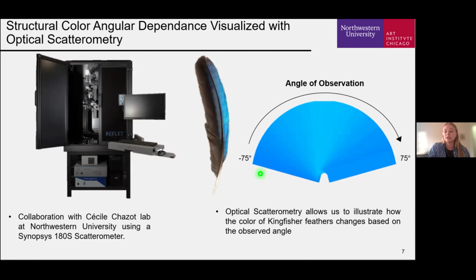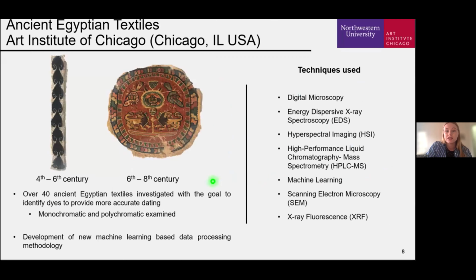We're currently working with Argonne National Lab to understand and examine these nanostructure features even further, and are really excited about the work in this project. So in the Kingfisher project, sampling was unavailable, but even when sampling is possible, as in our work on ancient Egyptian textiles, the degradation and the size of the samples, on the order of hundreds of micrograms, can present a lot of challenges.